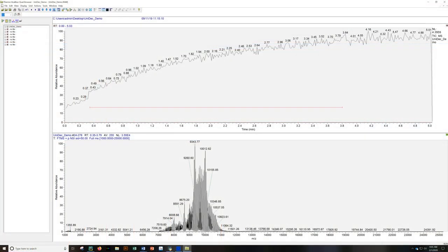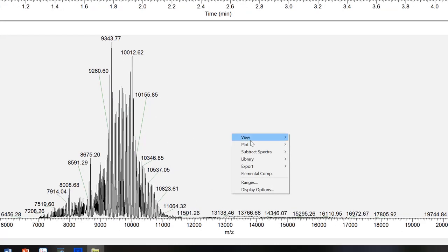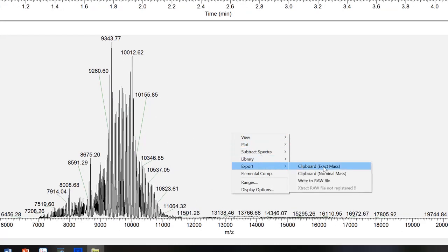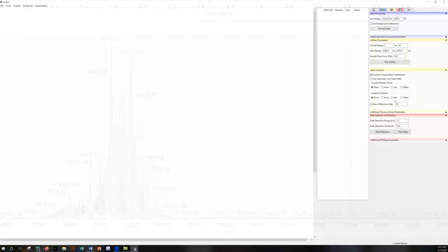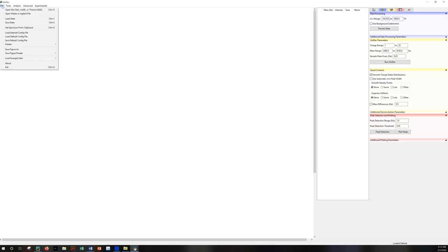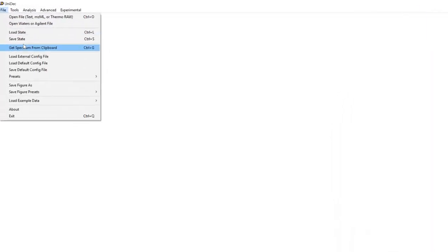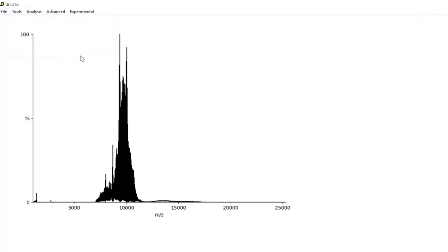If you are using Thermo's qual browser, transferring data to Unidec is simple. Right-click, Export, and copy to the clipboard. In Unidec, go to File, Get Spectrum from Clipboard. The shortcut key for this is Control-G.